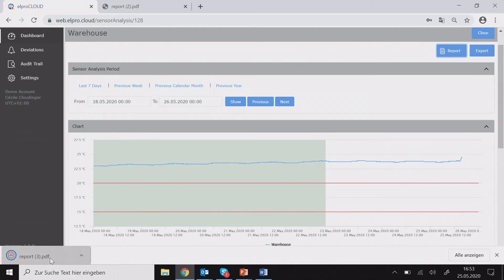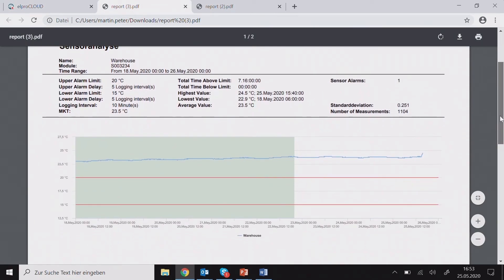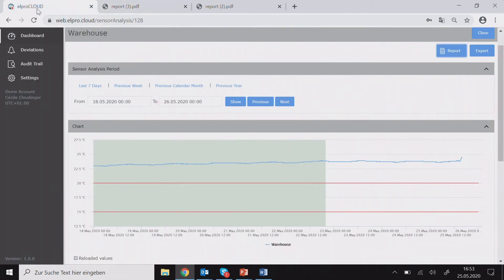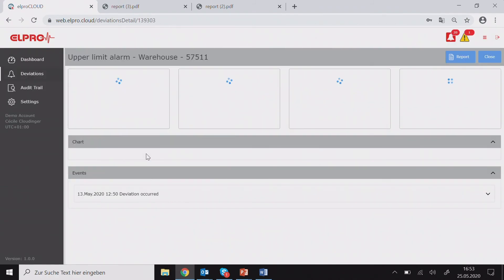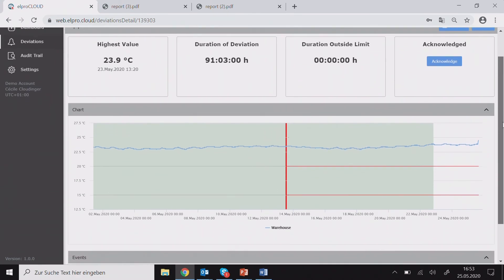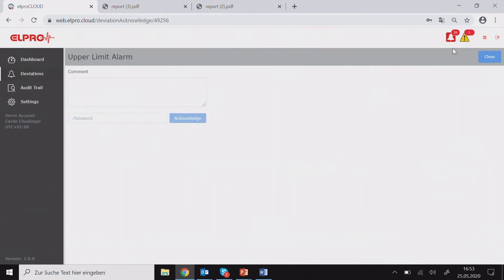The reports — for example a monthly report — can also be sent via email automatically. On the deviation list you get access to all the incidents and events. You get a handy overview of the reason for the deviation and its length, and from here you can also acknowledge by leaving a comment and your password.